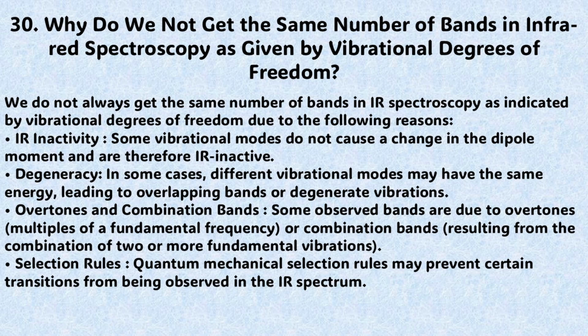Degeneracy. In some cases, different vibrational modes may have the same energy, leading to overlapping bands or degenerate vibrations. Overtones and combination bands. Some observed bands are due to overtones, multiples of a fundamental frequency, or combination bands, resulting from the combination of two or more fundamental vibrations. Selection rules. Quantum mechanical selection rules may prevent certain transitions from being observed in the infrared spectrum.